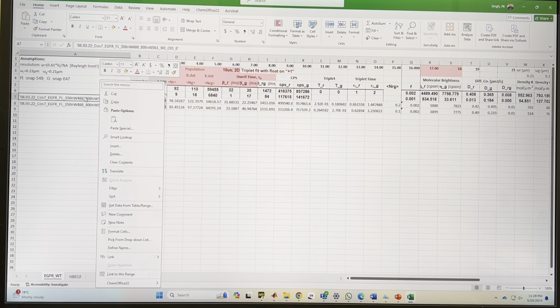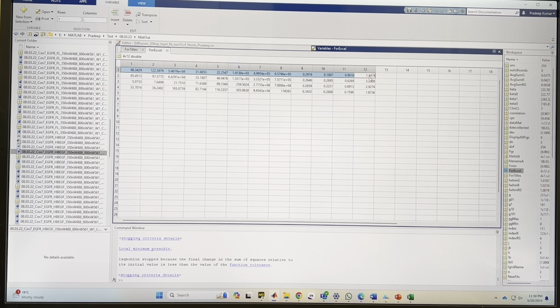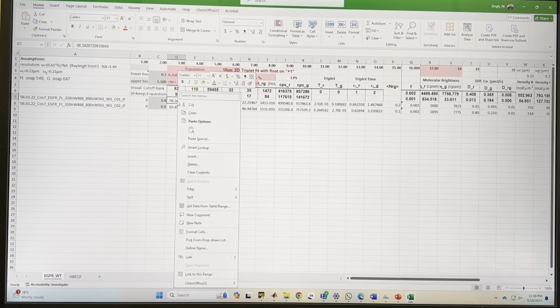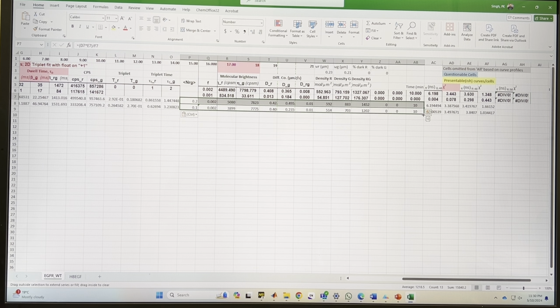Okay, so I will choose the first one and then paste the new data point here, whatever I got. So this is the file name, and then I'll take the Excel sheet for the initial 2, copy, go to the Excel sheet, and paste it here. These are the parameters we got from here. Since I have only 2 readings, you can go for more, whatever you want. Then drag this parameter down, and it will give you the values. In my case it is not showing anything because I already prepared this one, but if you have a new reading, it will show you everything changed.